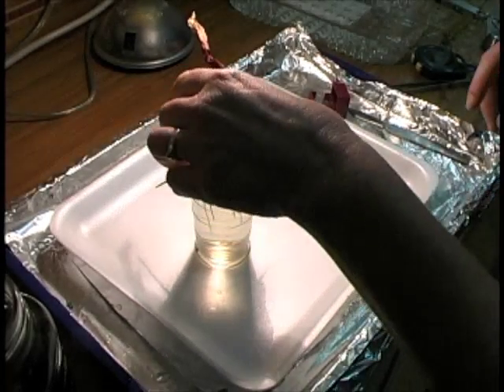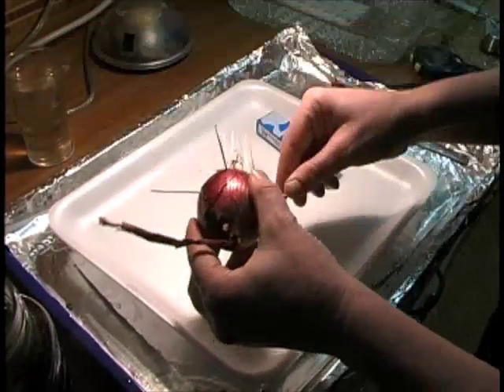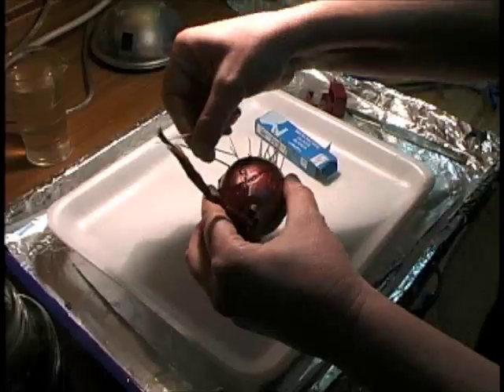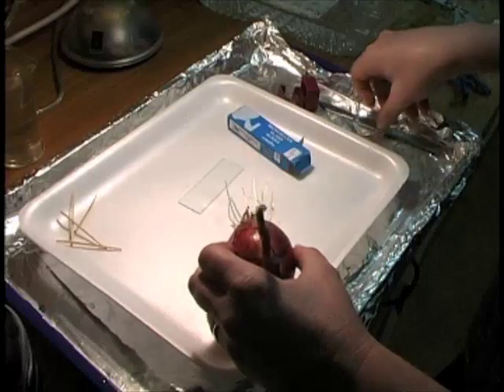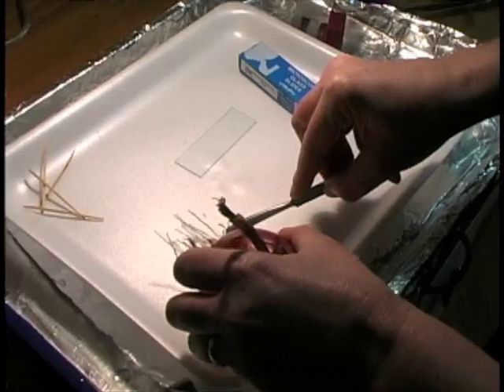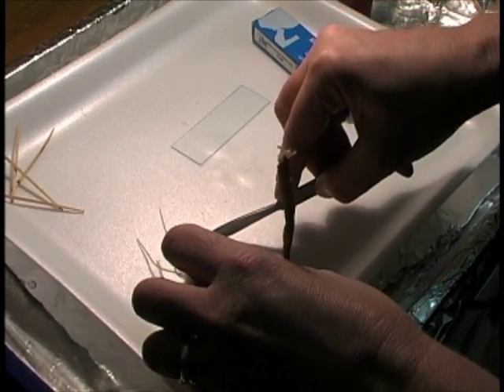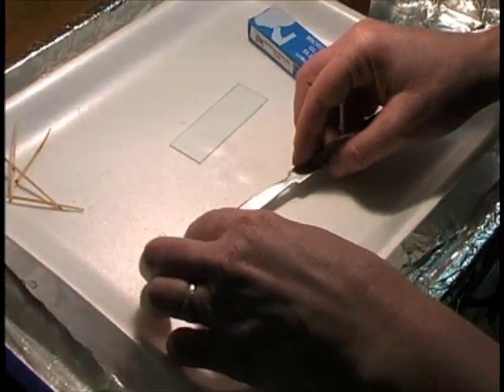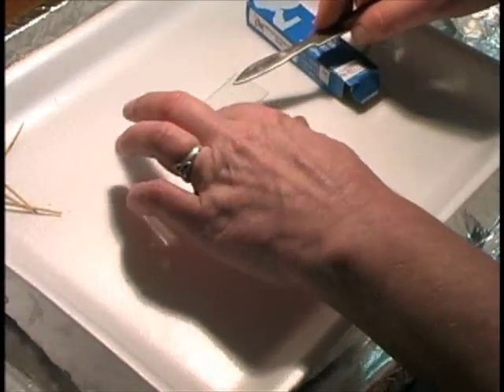Now it's time to use our onion to do our own slide. I'm going to take the toothpicks out of the onion so I can lay it down on my foam tray and use my scalpel to cut off a few of the root tips. I want just the very end of the roots because that's where the most mitosis is going on. I've cut off three root tips and I'll just lift them with my scalpel and put them on the slide.